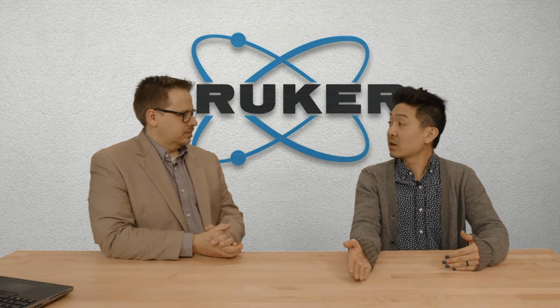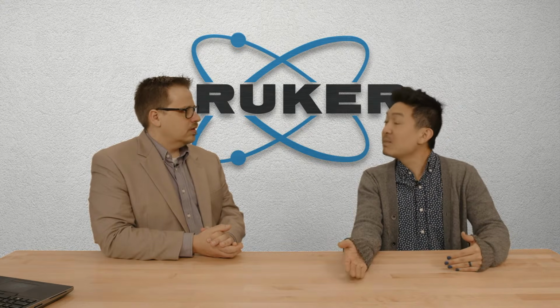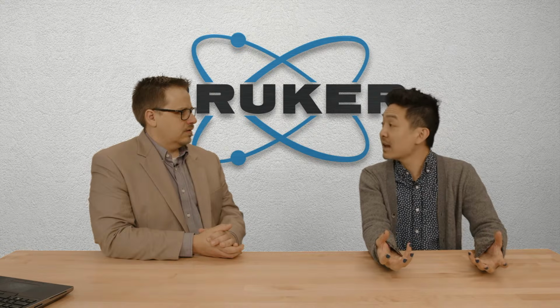What are you looking for? Are you more concerned with peak locations? Maybe the phase ID part of it is more important. Are you more concerned with quantification? Okay, well then maybe you need to take your data and move it a little bit forward. And that's what I really like about EVA is that it's sort of like our central workhorse for data analysis.